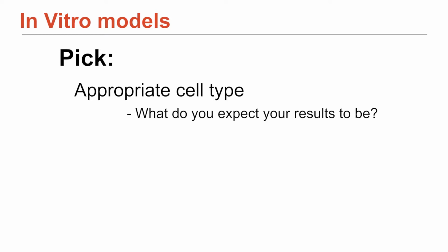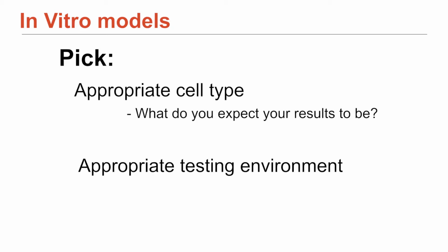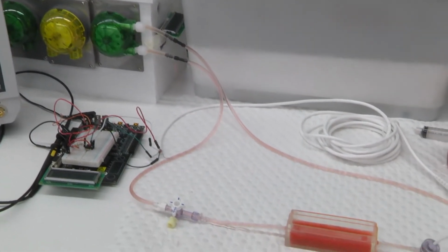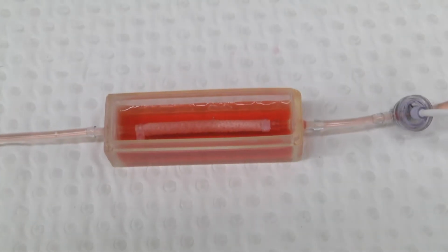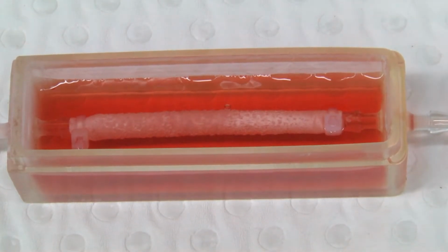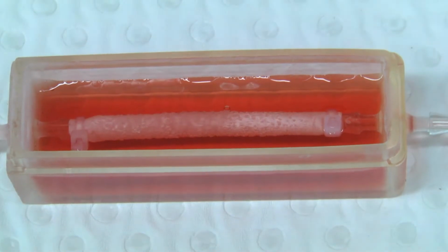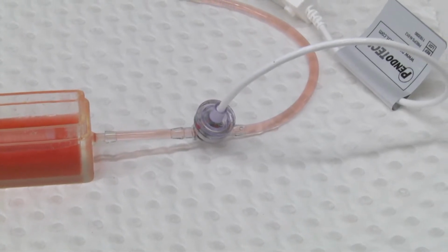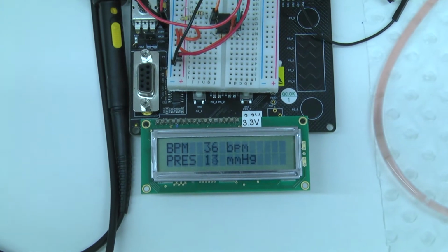And then what I want to showcase is what we touched on in the complexity part of the lecture most recently, but we didn't get to go through in a lot of detail. When we test vascular constructs in the lab, we're using this kind of bioreactor system that seeks to mimic more than one aspect of the biology, so not just cells stuck to a plastic plate. Our reactor allows you to put a three-dimensional graft in the reactor. We put pressure and flow that are replicative of what you find in a human, and we've got sensors attached so that we can see that output, and we've got concrete measures that the flow and the pressures we're putting in are appropriate.